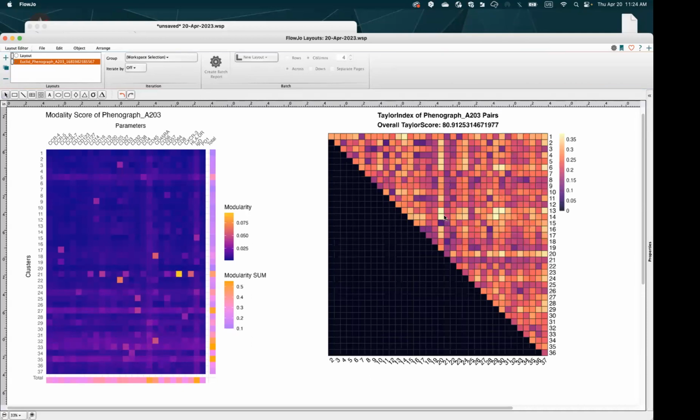On the right we can see the score. Again, we have a good clustering result, with very low similarities in the comparisons between the clusters. We can also check that with Cluster Explorer. For example, now that we have this table, if we find our specific cluster of interest, we can compare and see, are we sure that this cluster is one, or could it be that it's the same as another cluster? So that's the way to go.